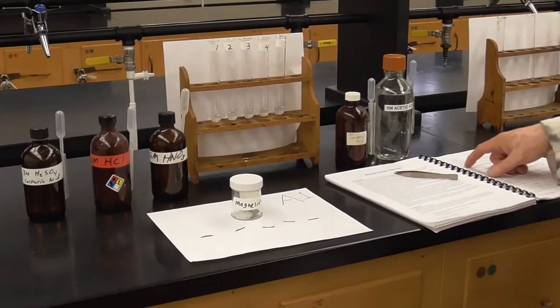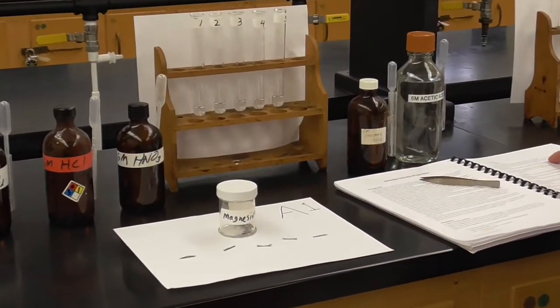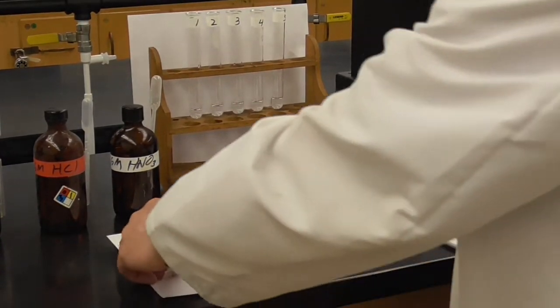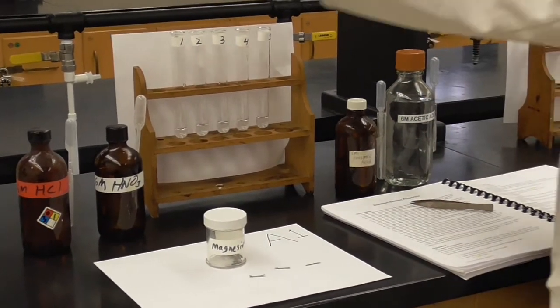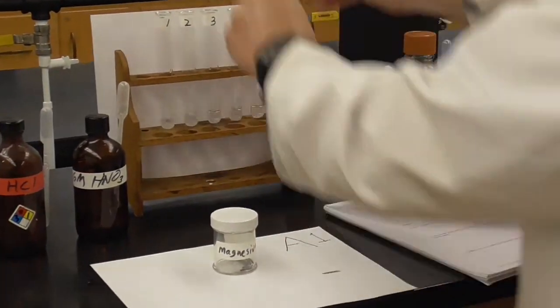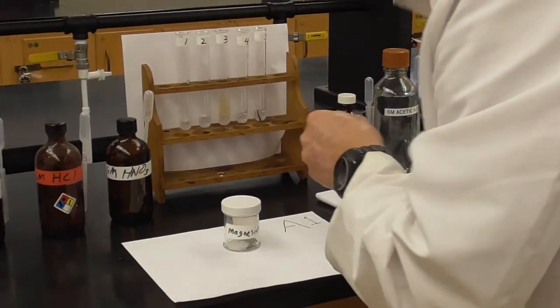All right, next step, it says, prepare your strips. I've got them ready. It says, at the same time, or as quickly as possible, put 1 piece in each test tube. So I won't be perfect at this. Maybe get 2 at a time. I will very quickly try to get them all in at about the same time. So ready, set, go. Drop those in. Drop these guys in. And drop them.